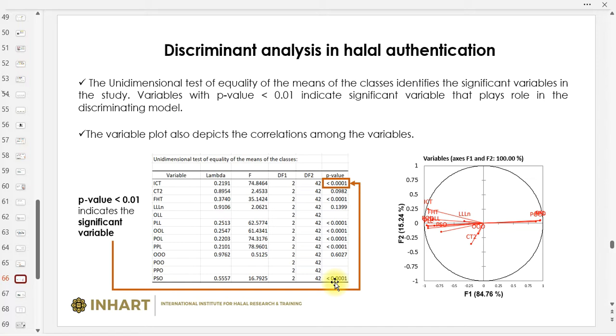So that indicates we can propose to any of our laboratories or in our study, instead of running 13 variables, is it 13? Okay, 11, for example, 11 variables. Actually, only 7 variables are needed for our study. So we can reduce costs, no hassle on getting results, and so on and so forth.